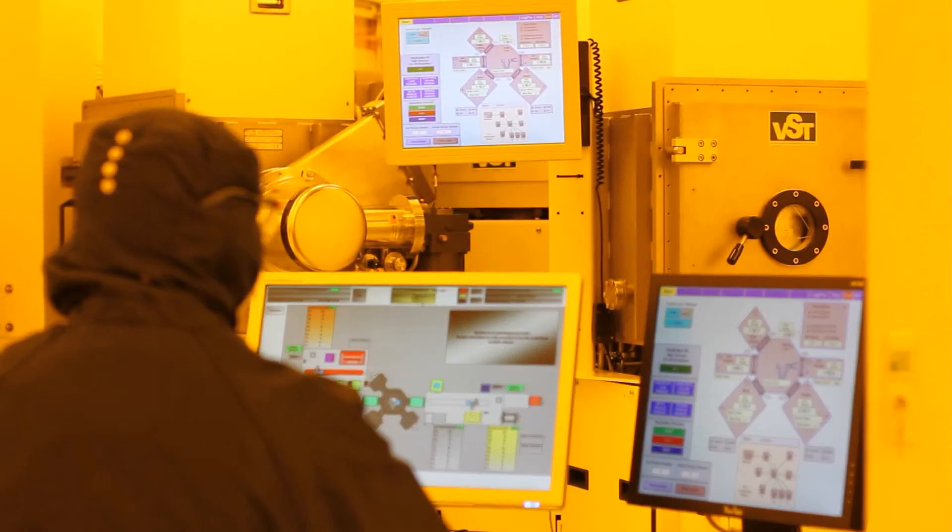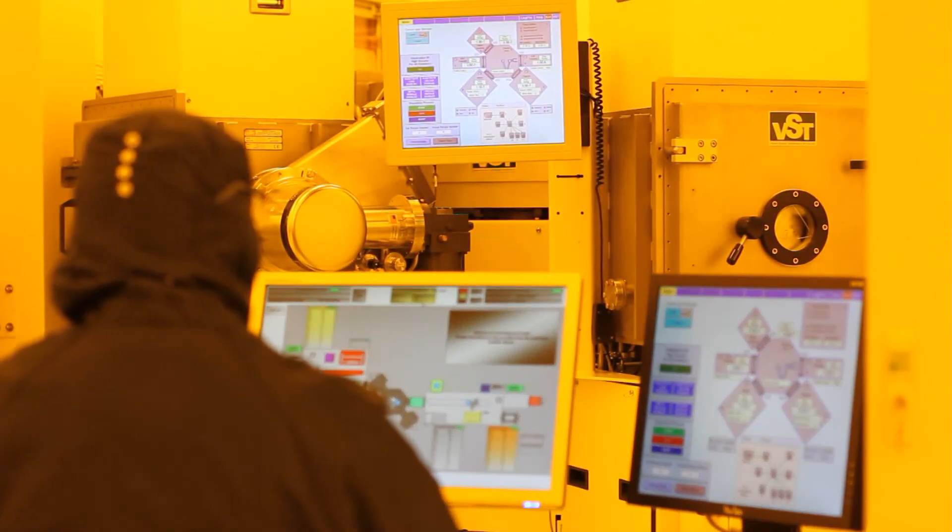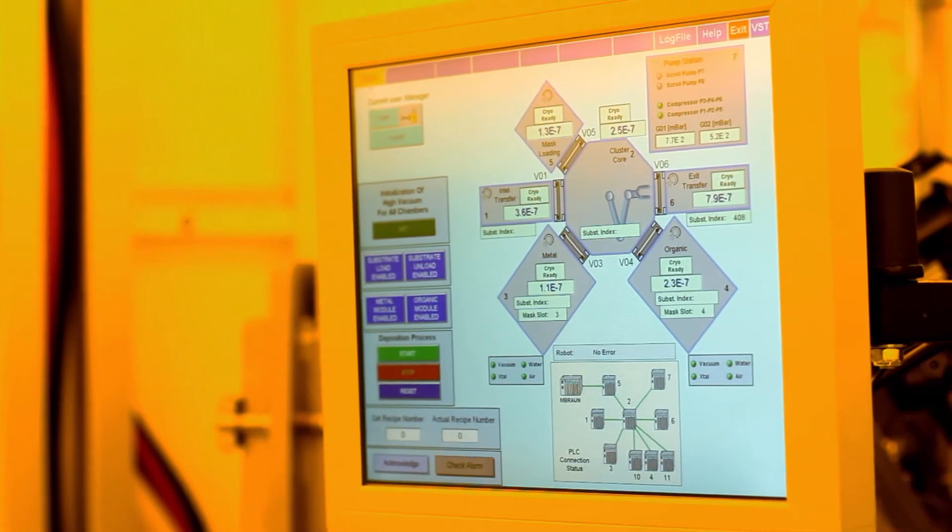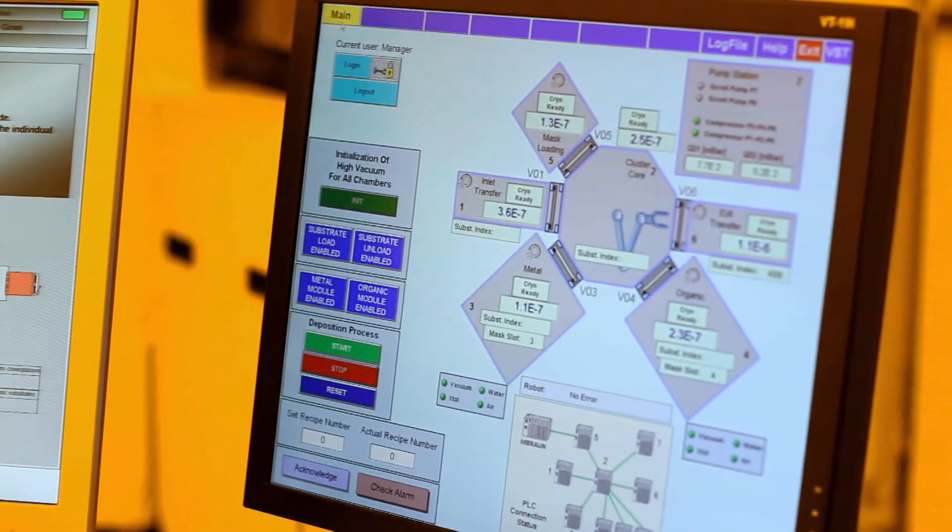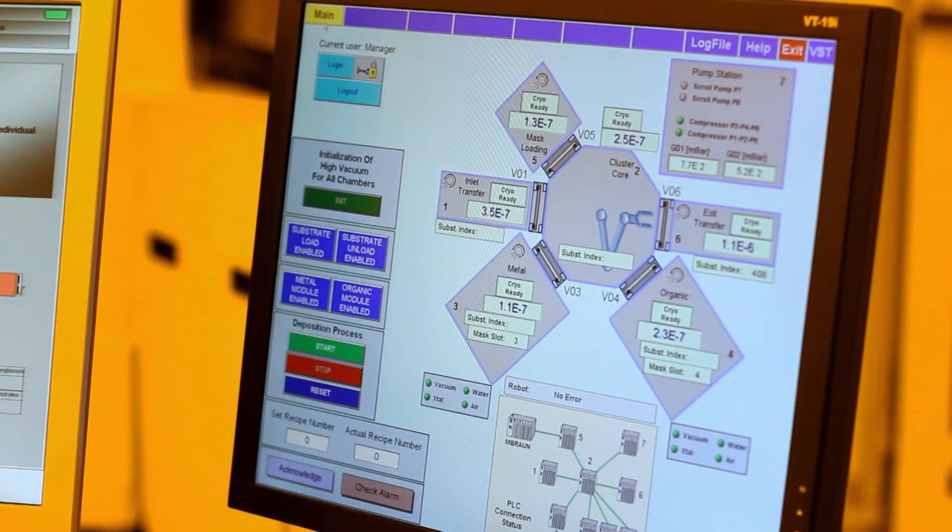The evaporation tool is based around a cluster system consisting of three chambers: a mask chamber for the storage of up to ten masks and two process chambers to perform metal and organic thin film deposition.